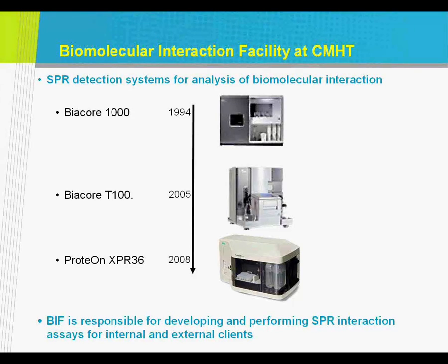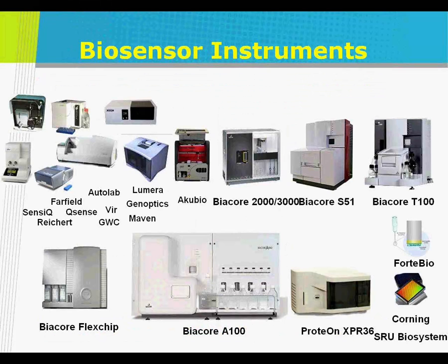I'm not going to go into it, but you can address biomolecular interaction in various ways, where you're interrogating, let's say, one protein with one analyte, and you can interrogate 4 targets. With the other instruments, you can interrogate with one analyte and look at 400 targets. You can do 4 on 4, 1 on 16. With ProteOn, and I will be talking about that a lot more, you can do up to 6 on 6, and other instruments, 8 on 16, and so on.